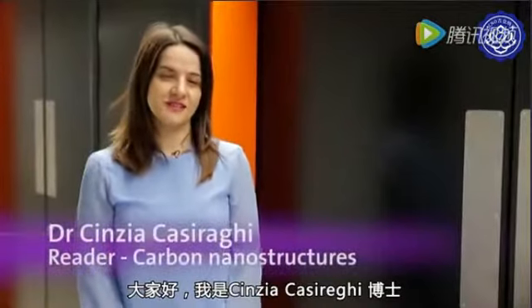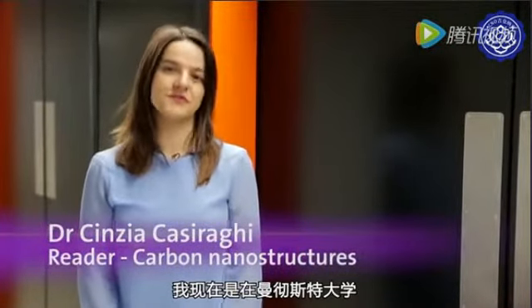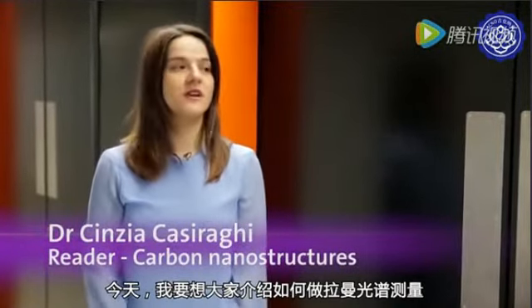Hi, my name is Dr. Cinzia Casiraghi, and we are here at the National Graphene Institute in Manchester. This is the Raman room, and today I'm going to show you how to take a Raman spectrum.